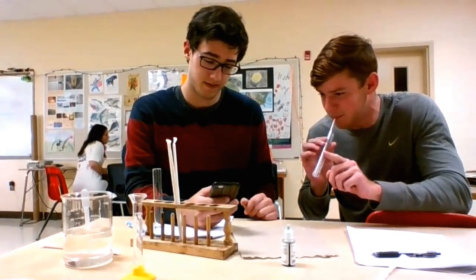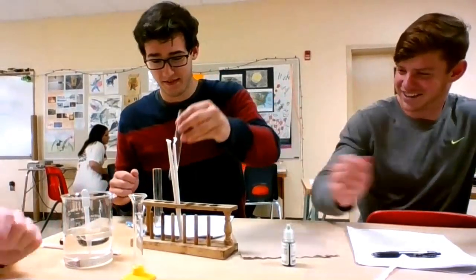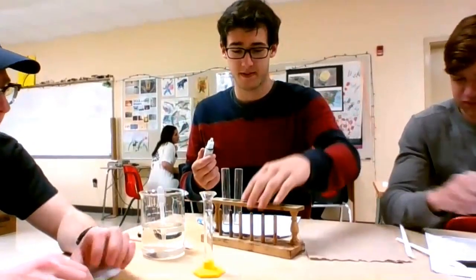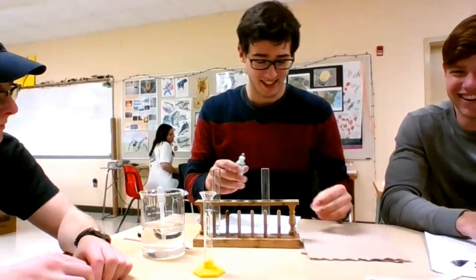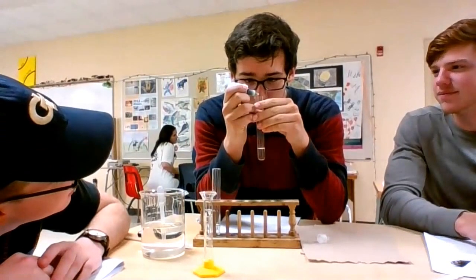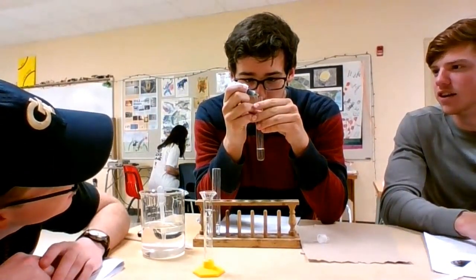That's good. Add 1 drop of indicator. It doesn't have to be perfect. Oh my god. You can put all that zinc in.